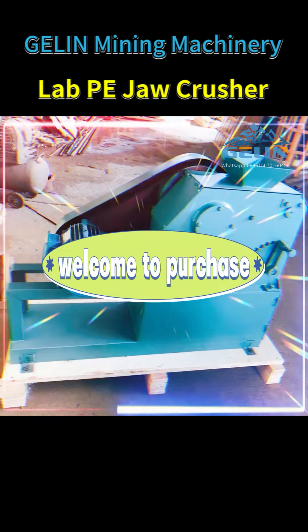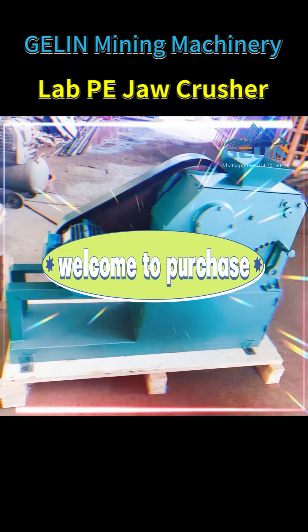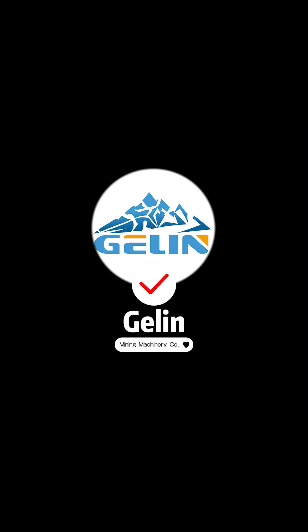Welcome to purchase. Follow Galen Mining Machine to learn more about mineral processing equipment.